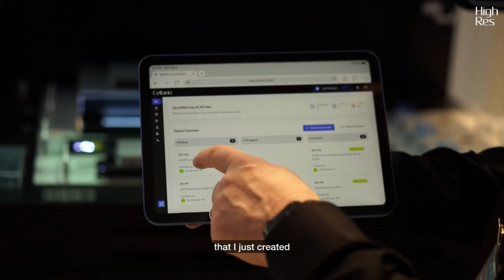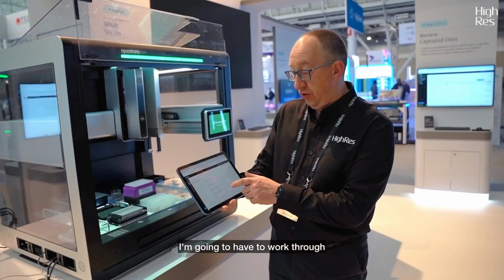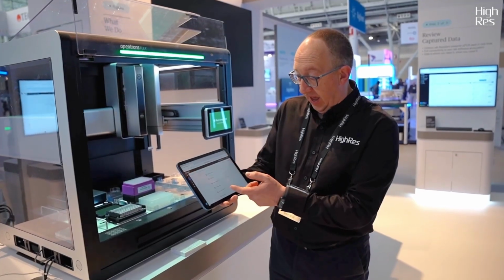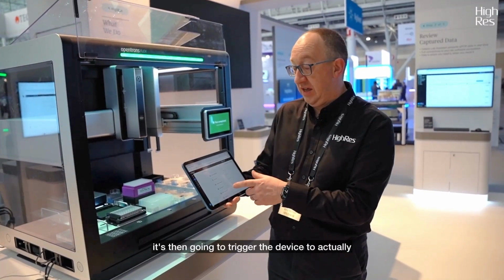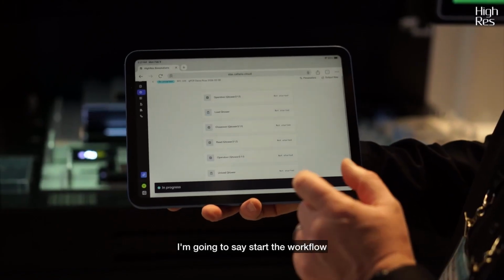I've opened up my dashboard on my lab iPad, which you can see in my pending tasks is the order that I just created. If I click on that, it's now going to show me all of the steps I'm going to have to work through. And this is a mixture of what we call guided tasks or digital SOPs and automatic device controls. So every time I complete a series of manual actions, it's then going to trigger the device to actually run that operation. I'm going to say start the workflow.